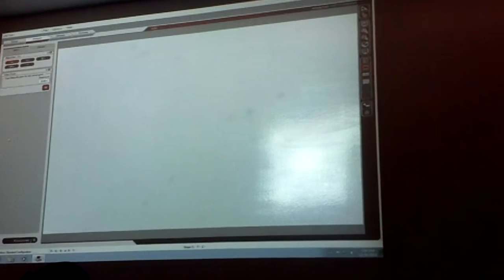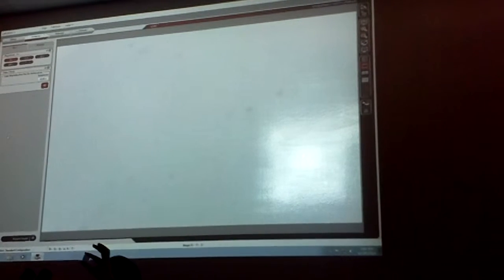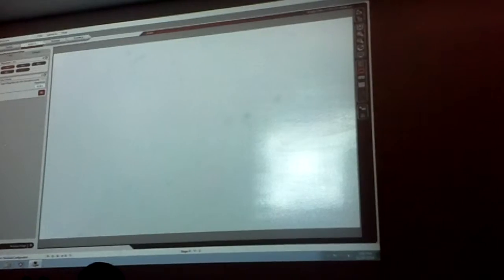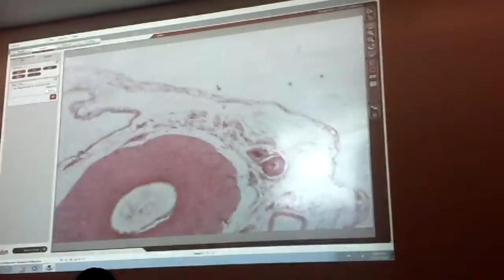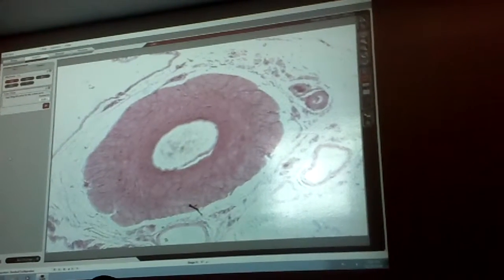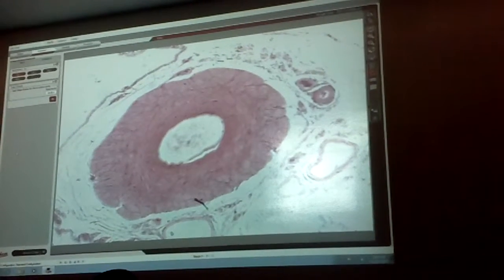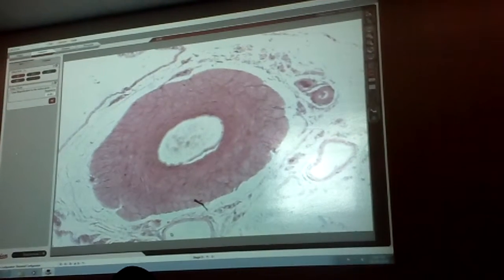On the spermatic cord slide, if you hold it up to the light, you're looking for the thing that looks like the donut. It's the circle. There it is. So that's the vas deferens. It has to have some muscle in there because it has to work with peristalsis to move the sperm from the testes up and around.